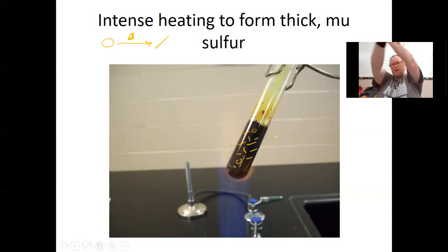constantly hitting up against each other, and it makes this liquid very, very thick. It's not like the thin runny stuff where those marble-like things could just roll past each other. Now we've got sticks, and they hang up on each other, and that's why this liquid is so thick. Also, the light is hitting this different structure in a different way, so that light is reflecting the dark color.